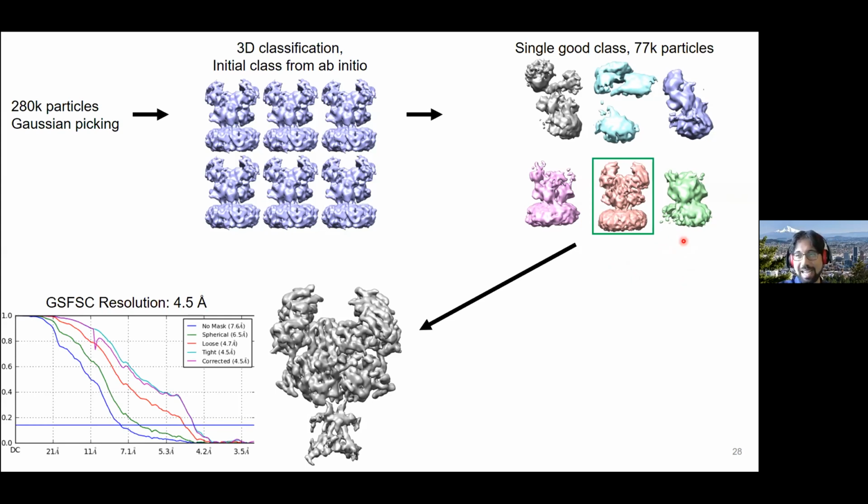And nowadays I do this on a lot of different data sets, because some of my data sets I like to break up into smaller pieces and analyze individually. So for each of those I go and do this sort of analysis, and almost always, even if you look at the 2D classes for a class that looks similar to your receptor, you end up seeing 2D classes that look like your receptor. So you would think that if you combine it, the final resolution might be better. But in every single case, when I combine them, it gets worse.